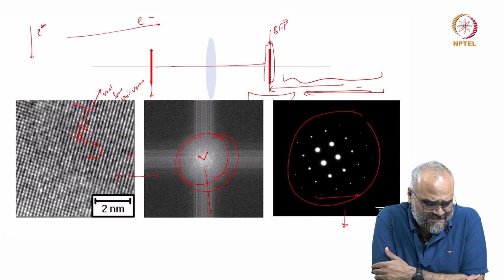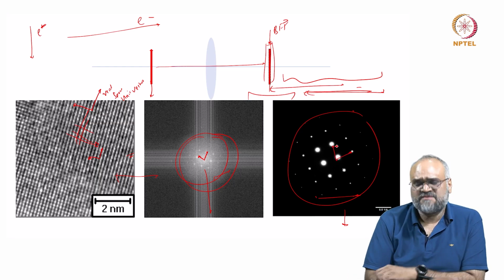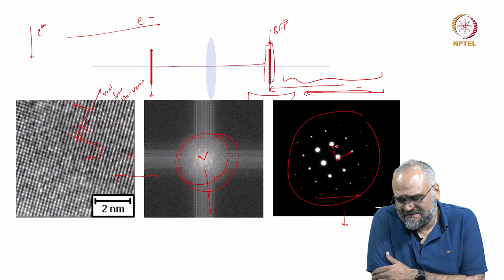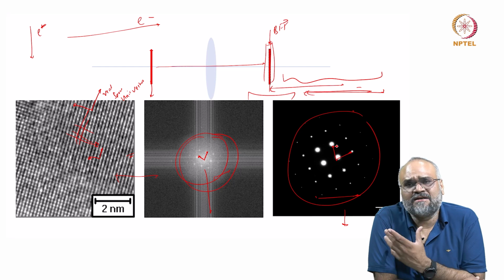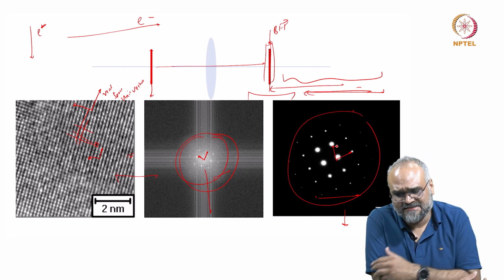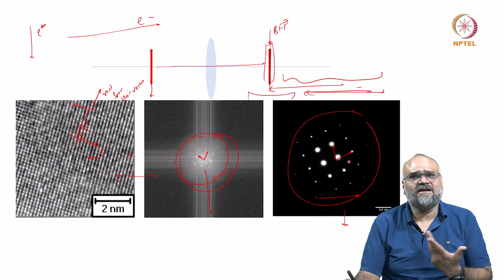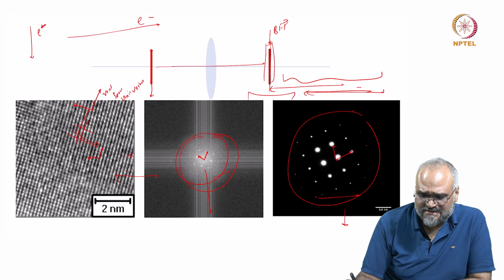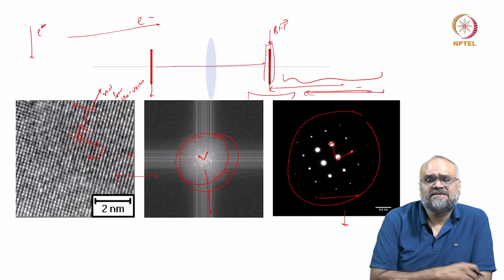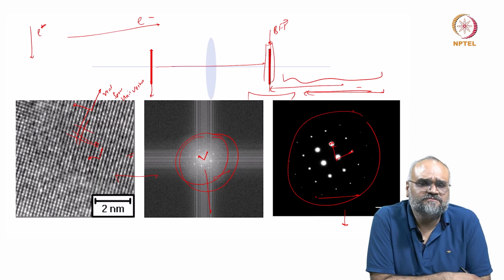Now, what is interesting is that these spots here are somewhat related to the reciprocal lattice, or this is kind of a projection of a reciprocal lattice. So, we can now relate all these through what are called Miller's indices, and you can start indexing which particular set of planes these diffraction spots correspond to, and that process is called indexing of a diffraction pattern.